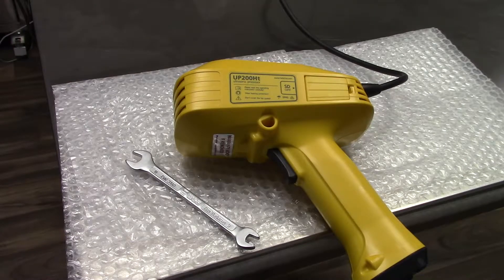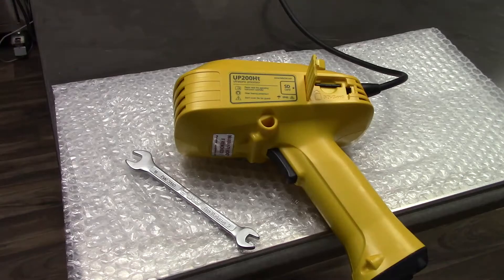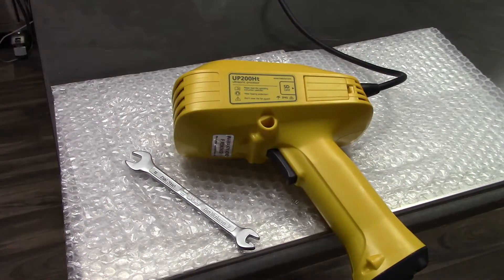Thank you for your purchase of the UP200HT ultrasonic processor. Detailed instructions for operation and maintenance can be found on the SD card within your unit. If this is not available, please contact your sales representative.